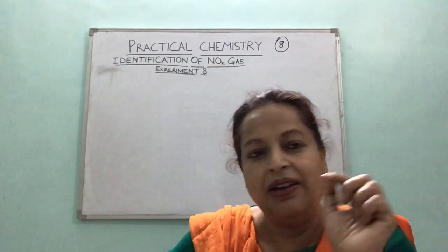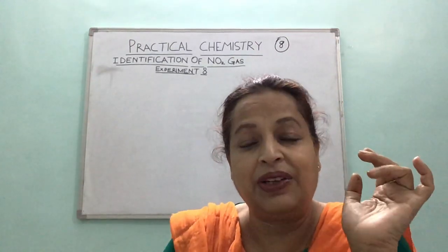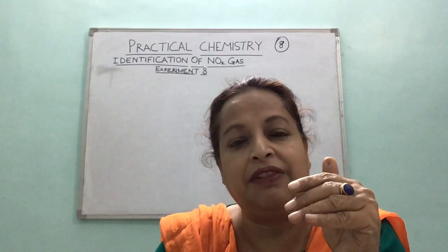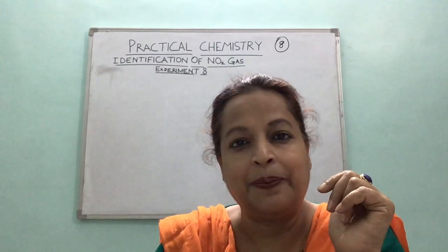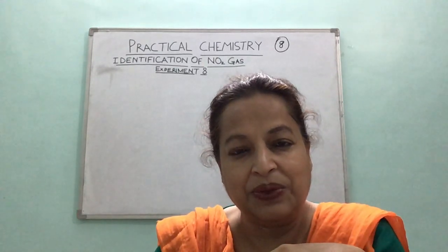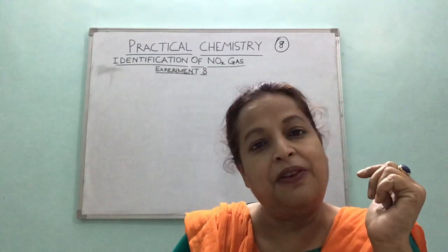Now one important identification of nitrogen dioxide gas is its color. When it is evolved, I'll show it to you, what is the color of that, and then you will remember that. And it's a confirmatory test.